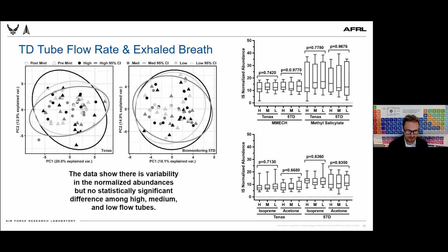And so we hypothesize that there is no one distinct source of variability, which you would believe, if it was based on flow rate, you would see more of your variability accounted for in the principal component analysis, suggesting that your variability is probably dispersed among all your principal components, suggesting that these data are very similar to each other, both in a targeted and untargeted fashion.